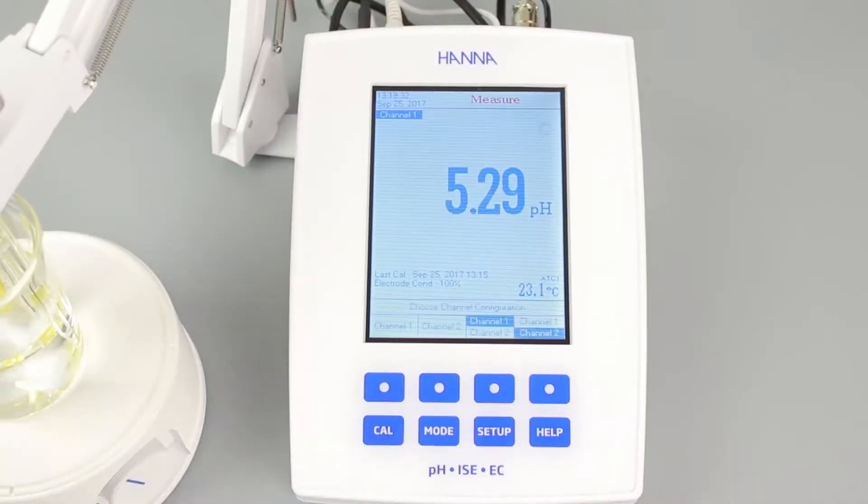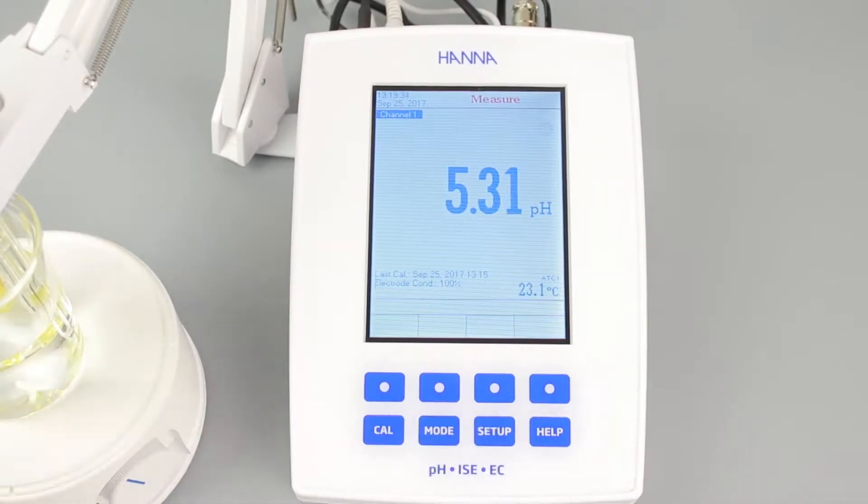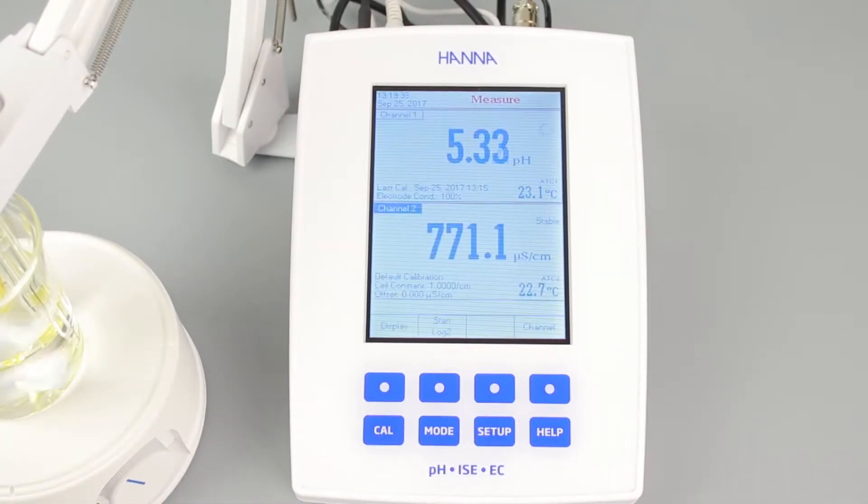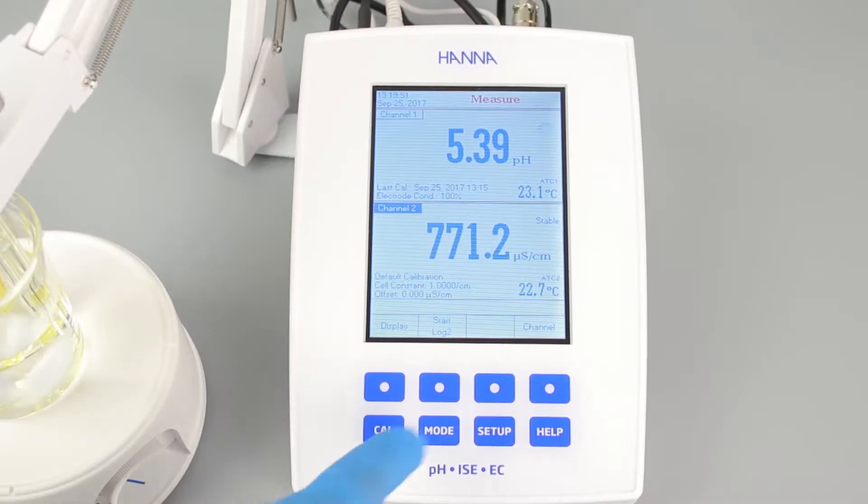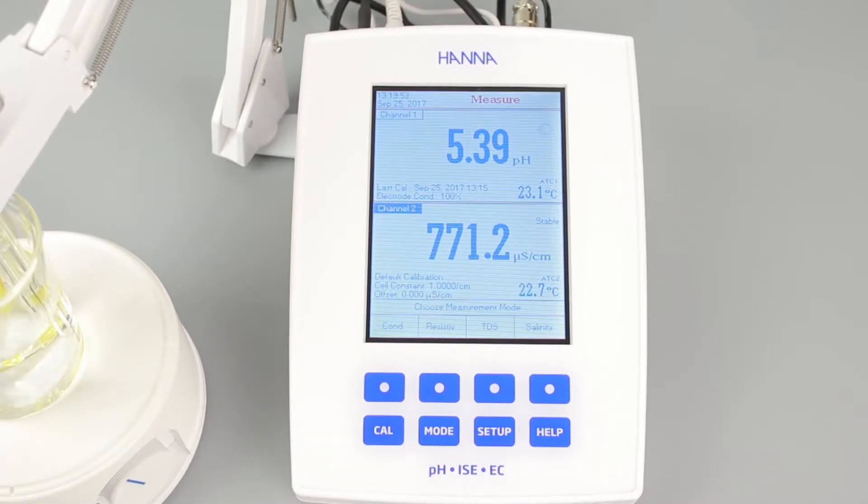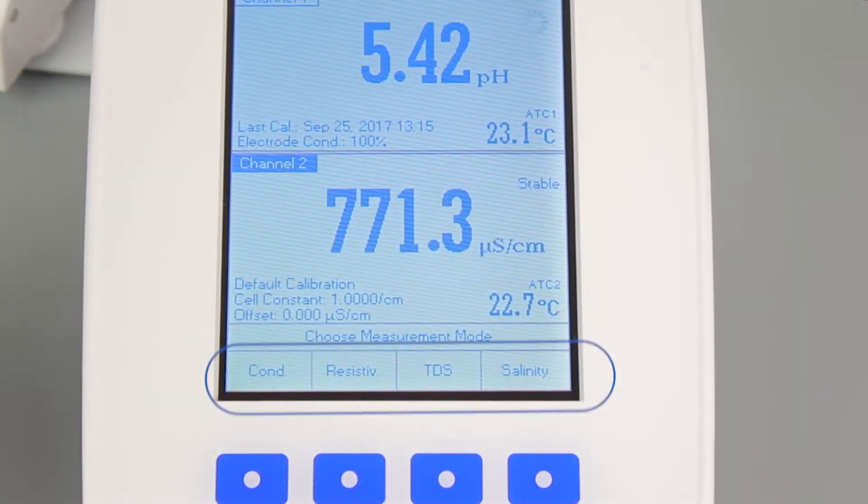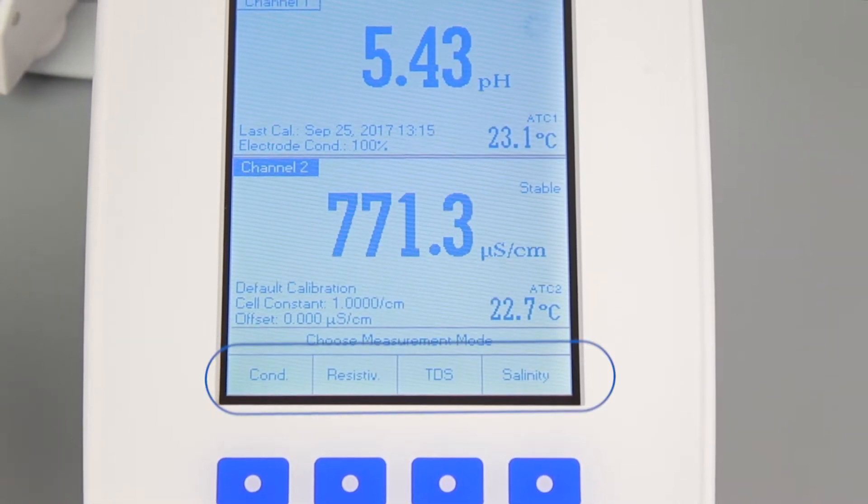Pressing channel and then one of the dual level display buttons will let you see both readings at once. When viewing EC in two-channel mode, press MODE again to switch between conductivity, resistivity, TDS, and salinity.